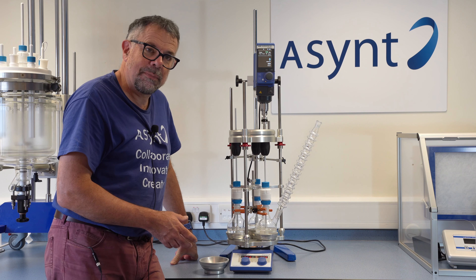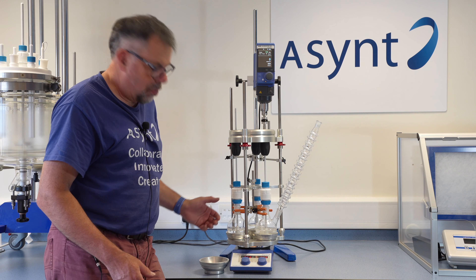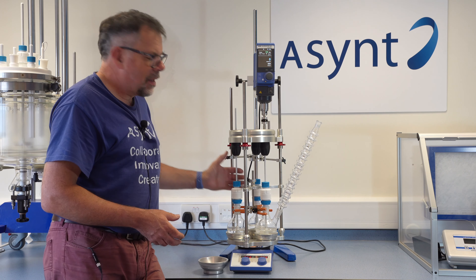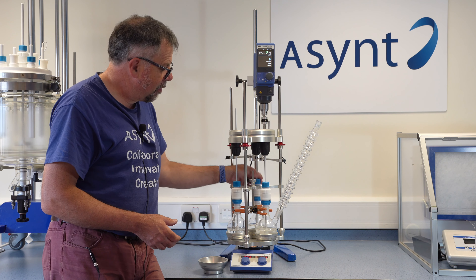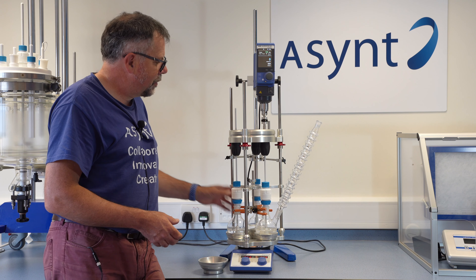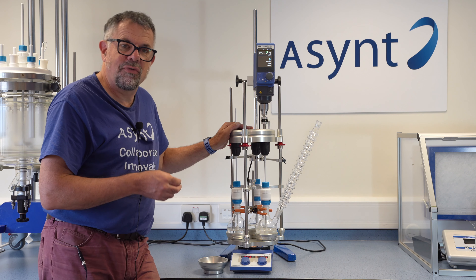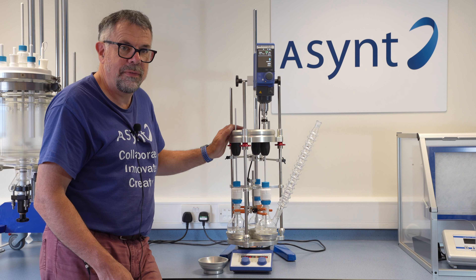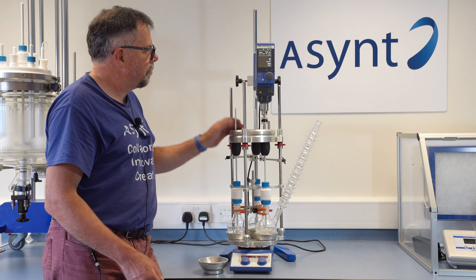Vortex is very simple to use. You can use your standard magnetic stirring hotplate you already have, DrySyn inserts you already have — known technology we use on our Reaktimate systems with the stirrer guides and stirrers. The gearbox is gear-driven, with longevity guaranteed. We've got some of these that have been in use for over 10 years on a daily basis with no issues, along with the standard overhead stirrer of your choice.